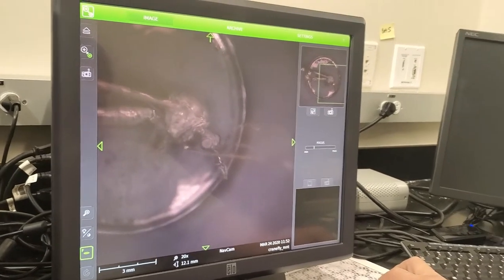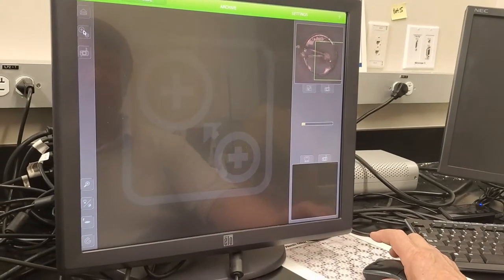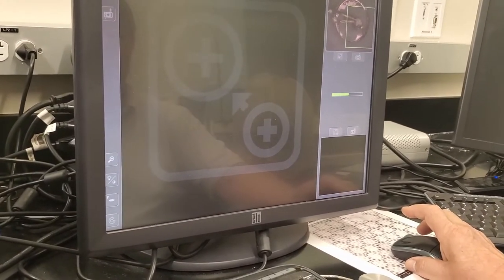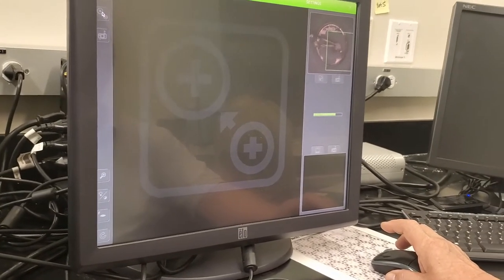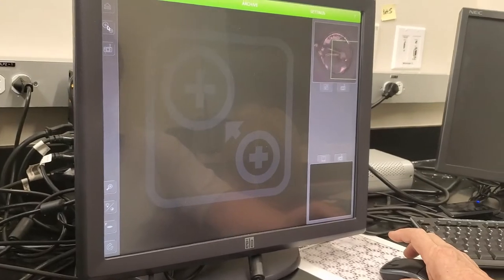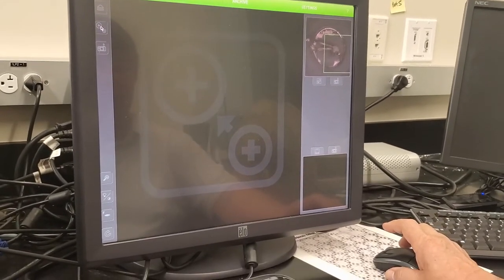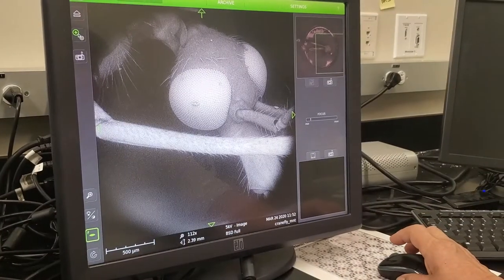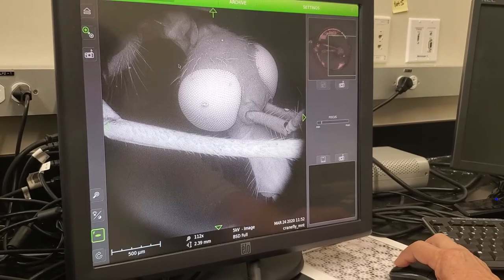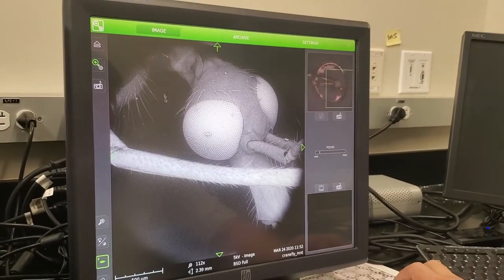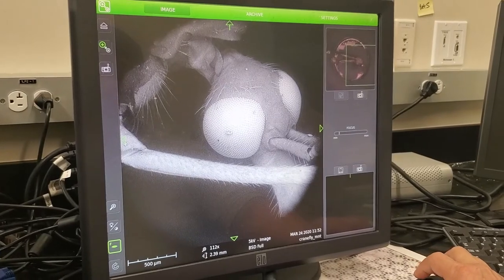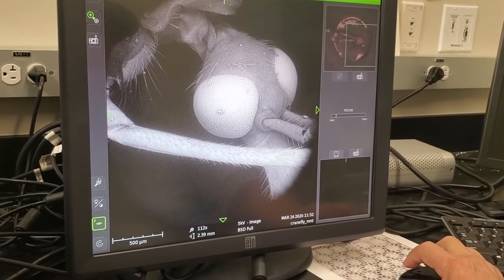Let's go in. Listen to the sound — that's the microscope talking to you. Those are the normal sounds for the Phenom Pro X. Now we've got to wait about five to ten seconds to make sure all the vacuum's settled. And then — there it is — the electron gun turned on. There's the antenna. There's the eye. There's his head. Then we'll go to the mouthpiece. Click on it. Look — it's a hairy bugger.